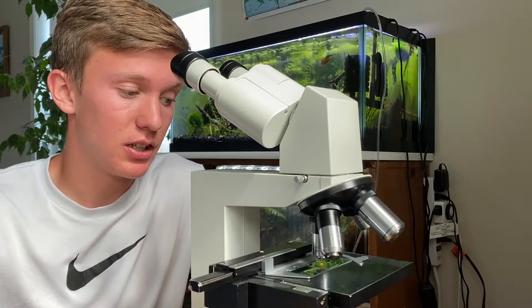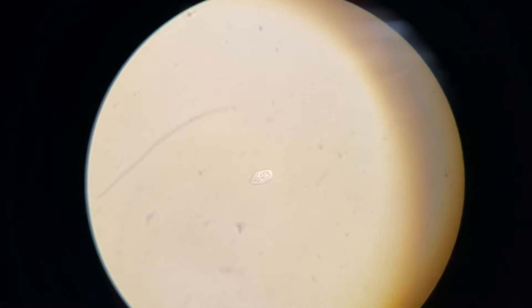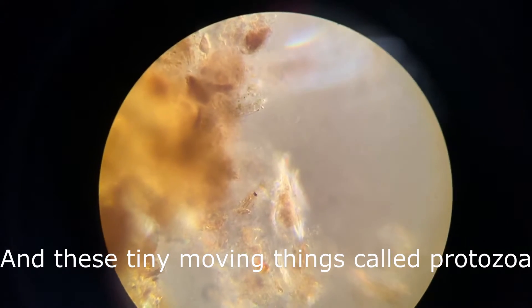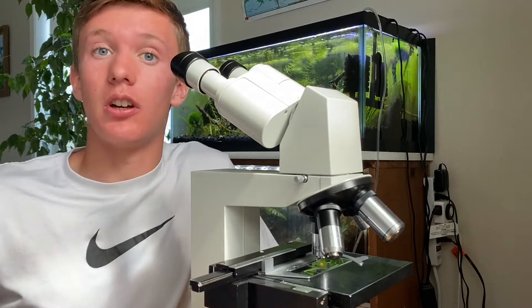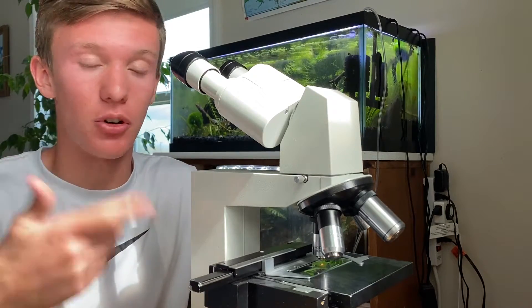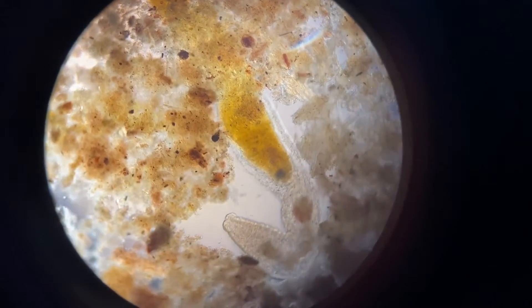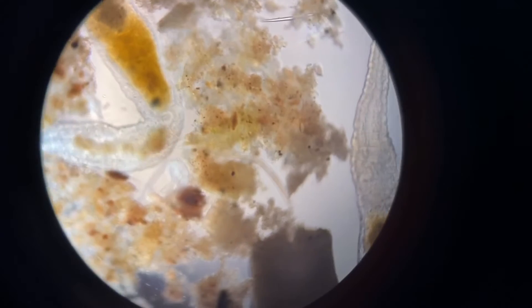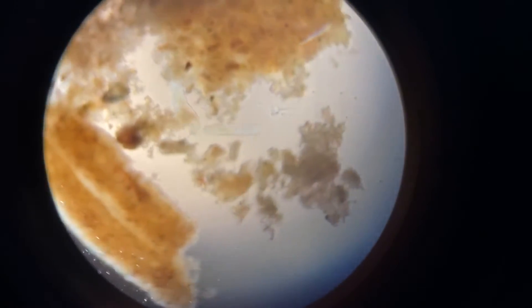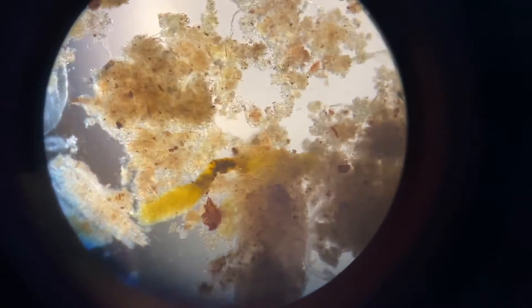The rest of those slides were pretty much didn't really have anything in them. The tank with the most microscopic life that I can see is this 5 gallon tank right here on my desk - it has the most. So I got a few more slides and put them in here. What I ended up finding was a whole bunch more of those worm things. There's two right here, and there's one over there. Now these things are pretty cool looking - there's a bunch more little worm things right by them, some smaller ones, and there's some amoeba things. The 5 gallon tank definitely has the most interesting life inside the gravel.